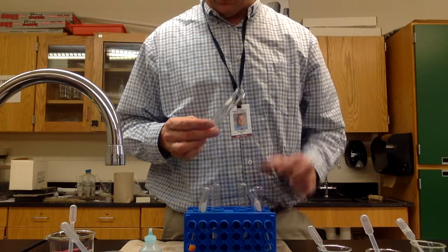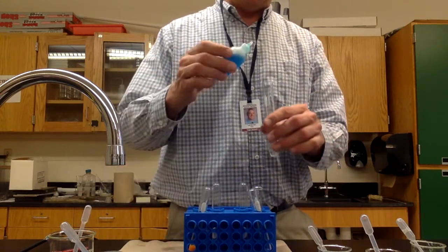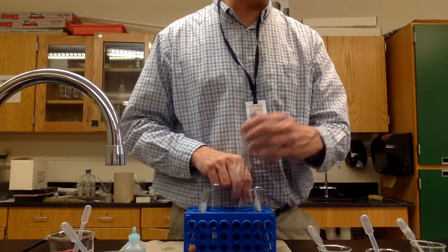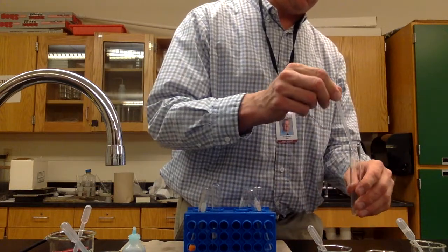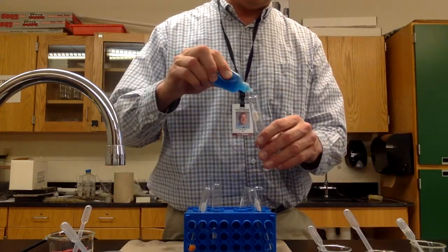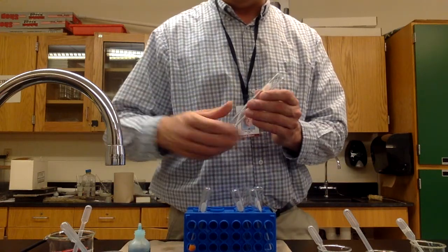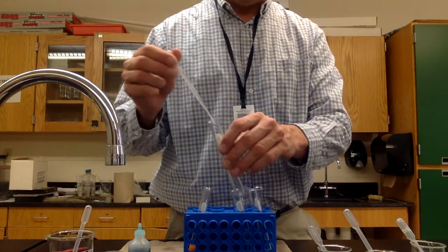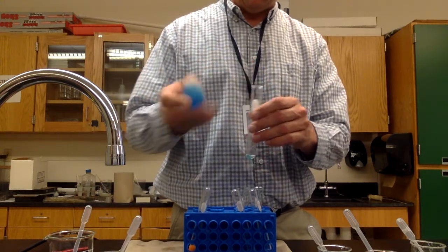This one's my water. Dropper full of unknown. 5 drops of Benedict's. Here's my B. Dropper full of unknown. 5 drops of Benedict's. And finally D. Dropper full of unknown. 5 drops of Benedict's. Super.